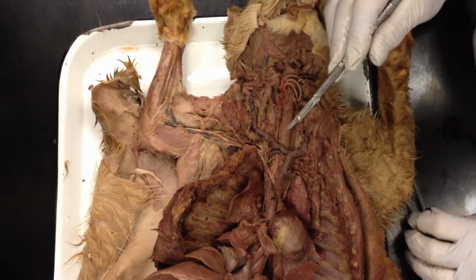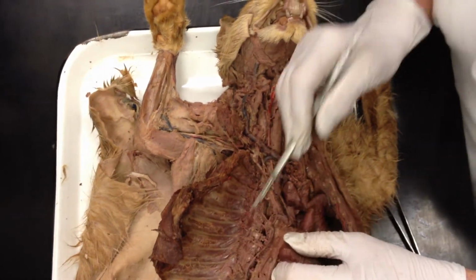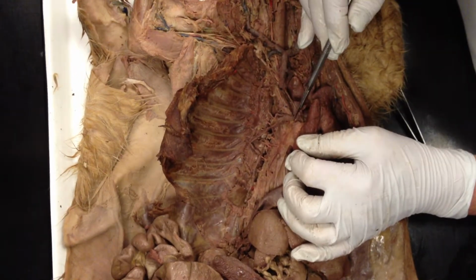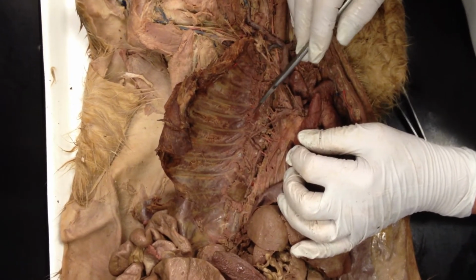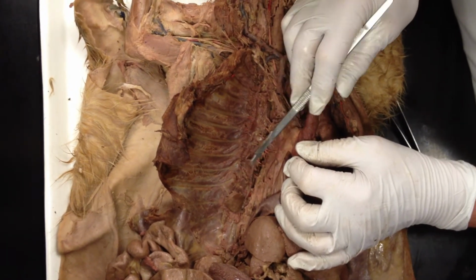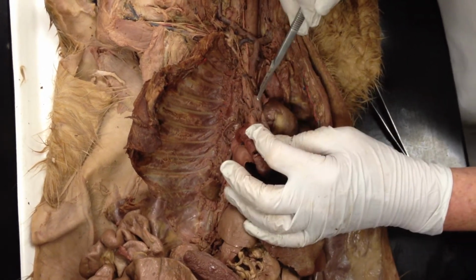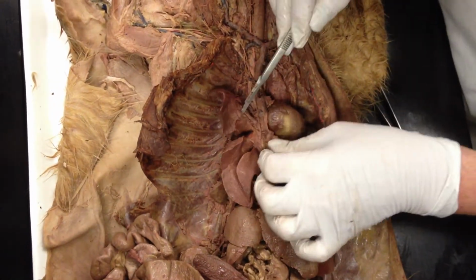Okay, if I move the heart to the left, what I'm going to find is the azygos vein. In humans, there's going to be a hemiazygos and an azygos, and that's going to drain the dorsal body wall of the thorax. So all of this is going to be dorsal body wall. This is azygos dumping into the superior vena cava. It will then go into the right atrium.